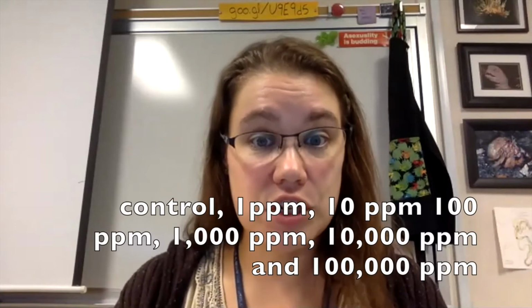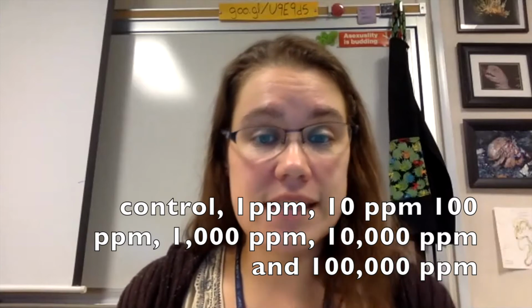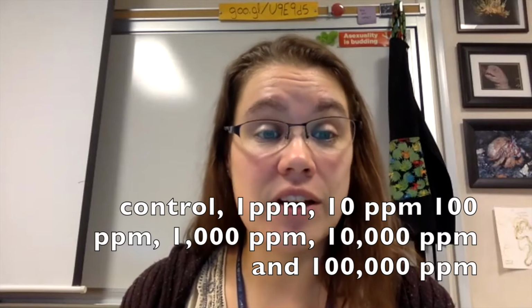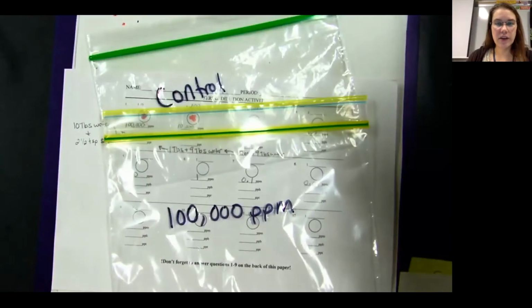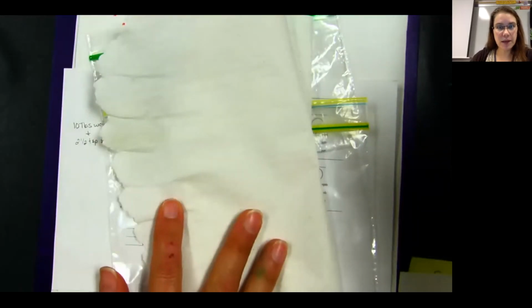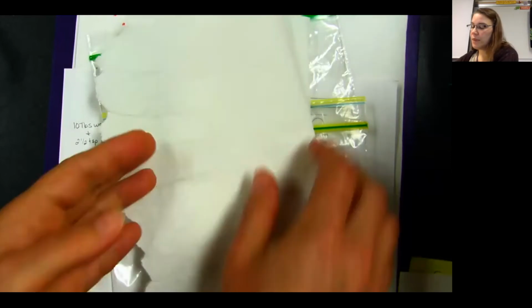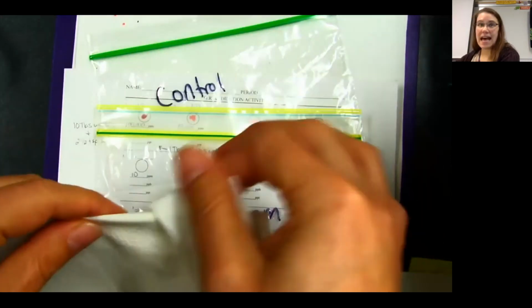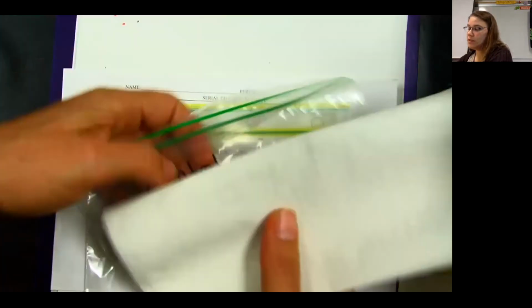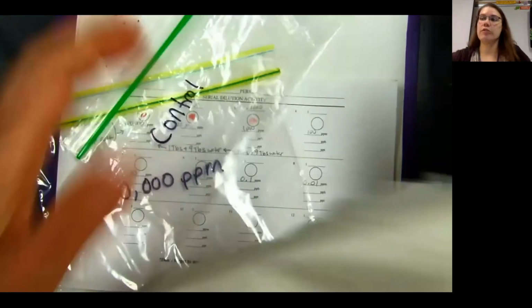Make sure that you label them as follows: control, 1 part per million, 10 parts per million, 100 parts per million, 1,000, 10,000, and 100,000 parts per million. Here are a couple of my baggies that are going to be used. You also need some paper towel. You should double or triple up the paper towel. The paper towel needs to fit inside of your baggies. So this one I'm going to have to cut a little bit in order for it to work.